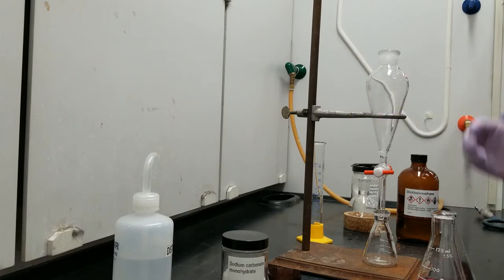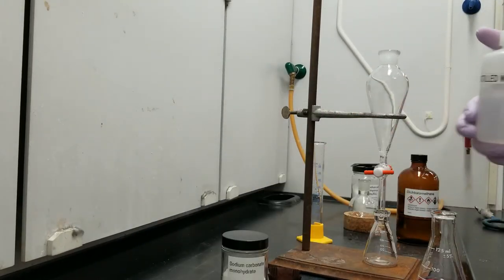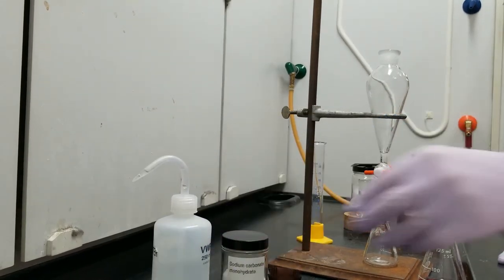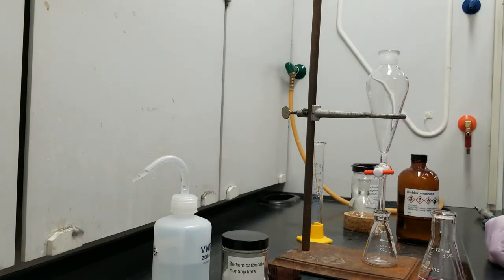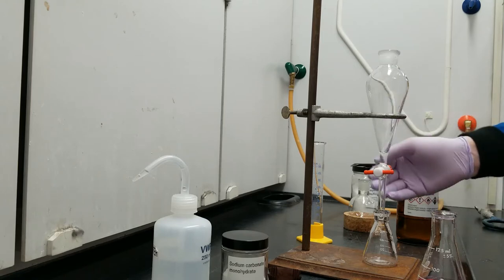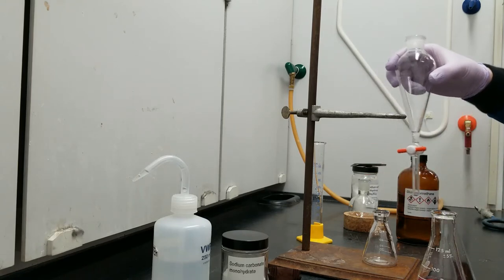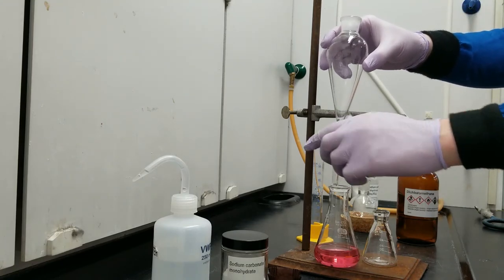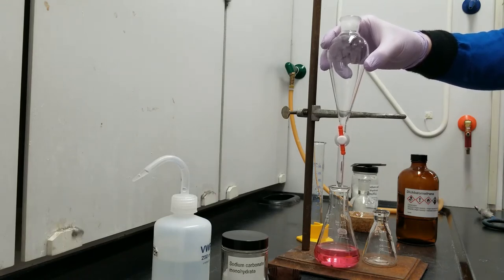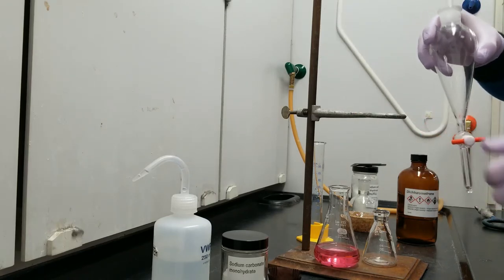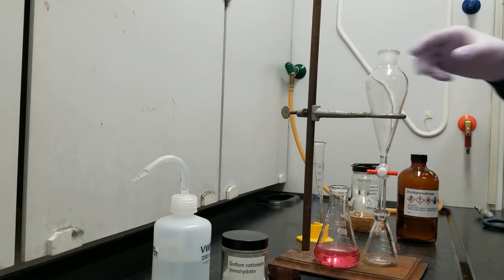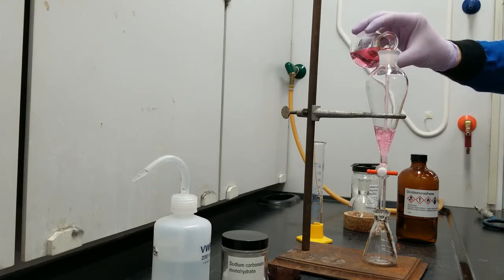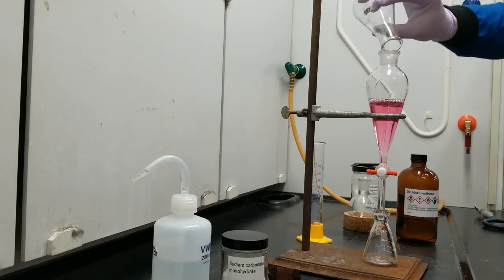Before I use my sep funnel, I'm going to do just a quick leak check. This is a bottle of distilled water. You can see that in the closed position, this is not going to allow any water through. But if I open it up just into the energy drink because it's just water, that's going to allow water to flow through. So good on leaks, ready to do this. And I'm going to add my energy drink to the sep funnel.